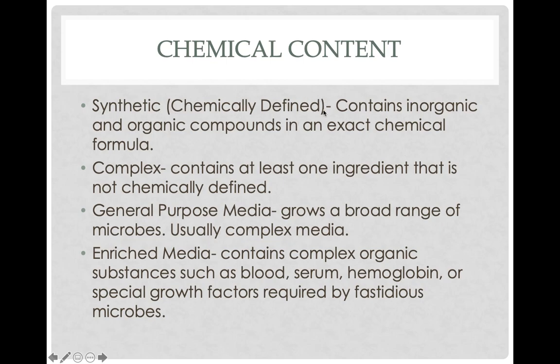That's important to know if you want to have very consistent, very reliable results that will always work in a microbiology lab to grow exactly what you want every single time. And then there are other types of agars that are called complex. And these are things like a tryptic soy agar. Tryptic soy agar is made from soybeans.